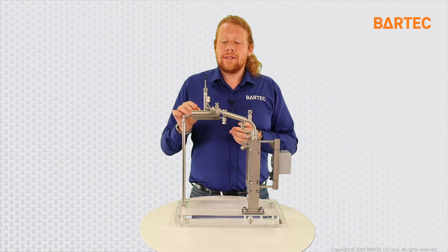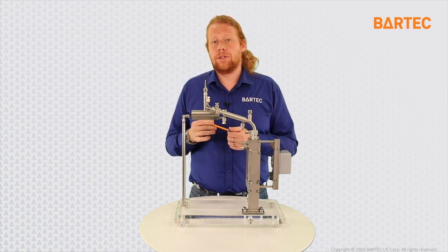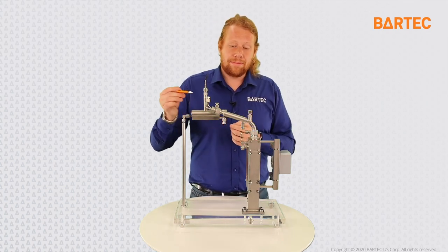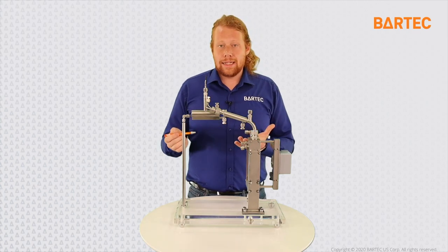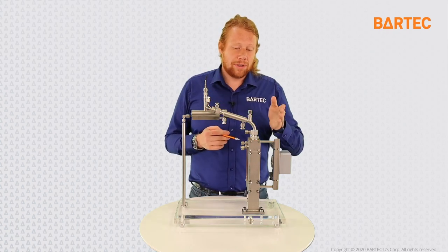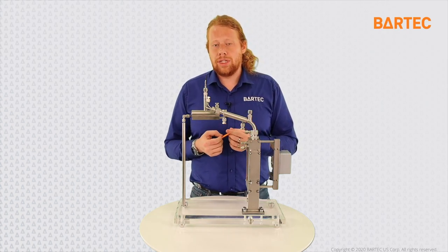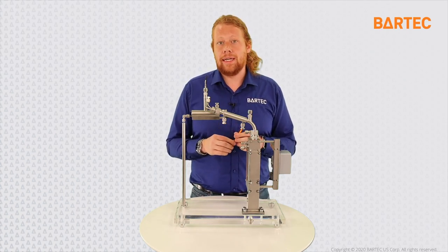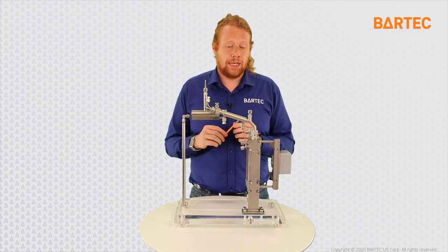As the sample evaporates, the vapors reach the temperature probe here, thus reading instantaneously the temperature of the gas before it goes into the condenser. The sample that gets into the condenser, as the name suggests, goes from gas phase to liquid phase by using the coolant, which is usually, as I mentioned, water. Water that can be provided, by the way, by a BARTEC Banky chiller that we also provide most of the time with our distillation analyzers.